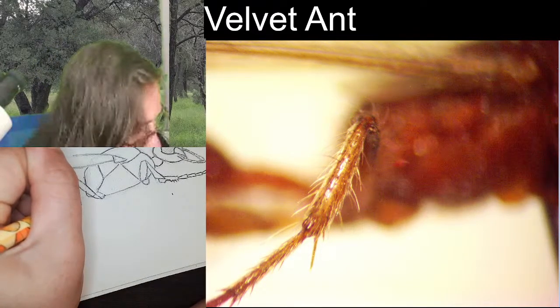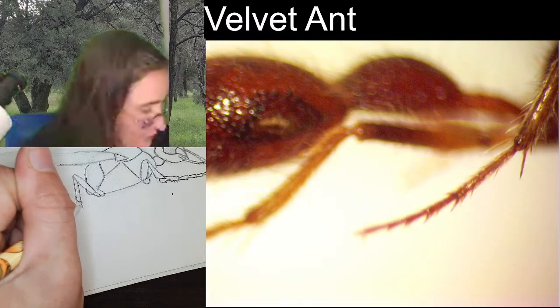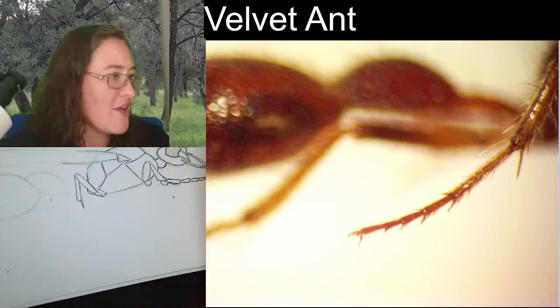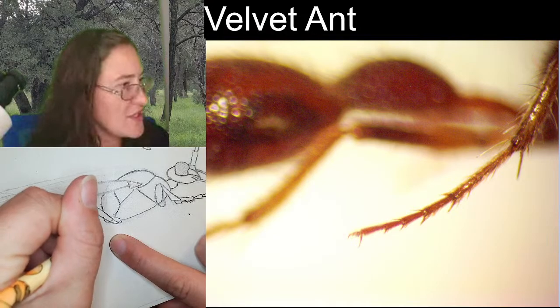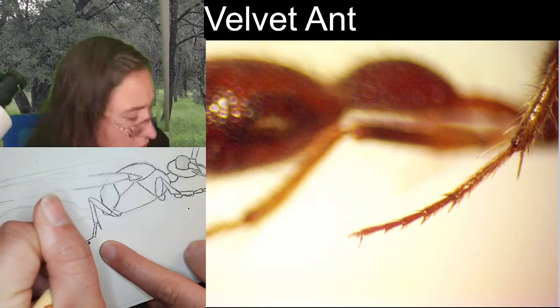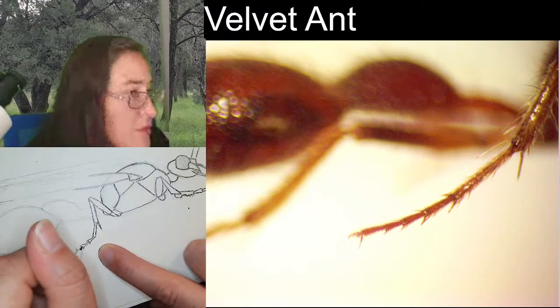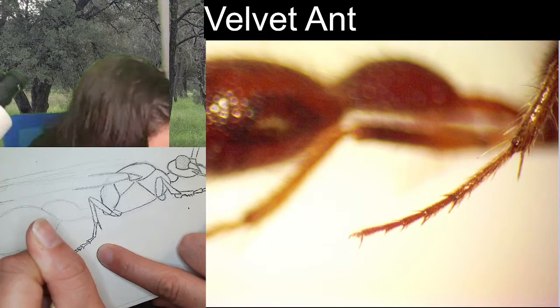Keep in mind, a lot of insects have fairly long tibia in comparison to their femurs, but wasps and velvet ants tend to have fairly short tibia and then long tarsal segments. Make sure I add this spine here. And then those are the tarsal segments. The first one is significantly longer than all of the others, and we do have 1, 2, 3, 4, 5 segments. So we're going to add those. 1, 2, 3, 4 is tiny, and then 5 is kind of narrow but longer with the claws.